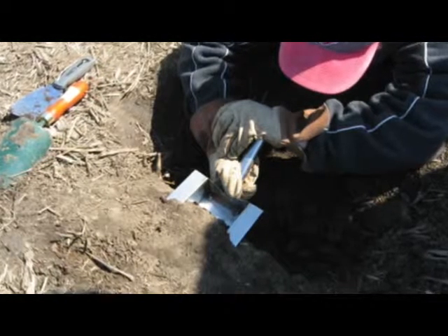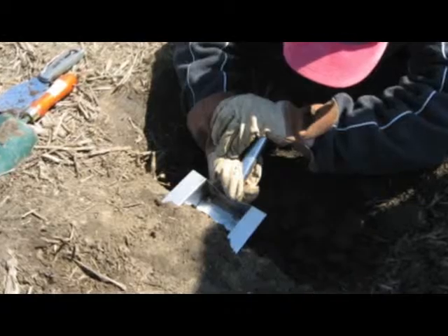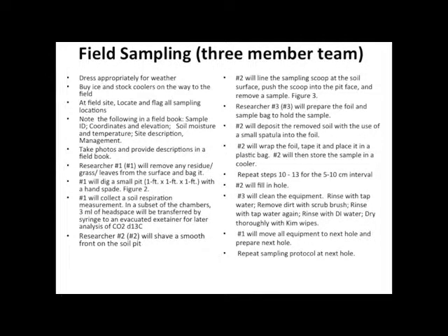Consistency in sampling methods is important to allow for fair comparisons among sites. Therefore, we are presenting here the procedure that will be used as the basis for collecting soil samples in the IML-CZO. The sampling procedure described herein is designed for 3 people.